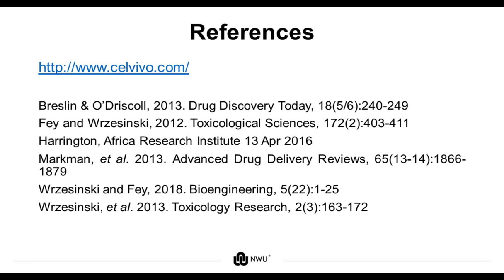So let's get started. Our first question is, how does the MDR1 and PGP result in spheroids compared to those in 2D cultures?